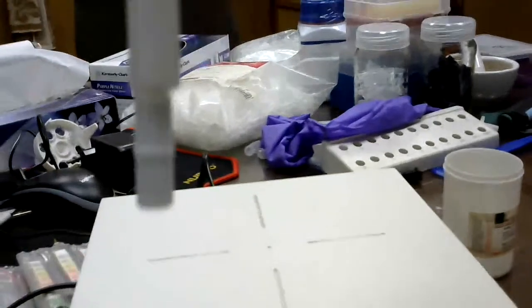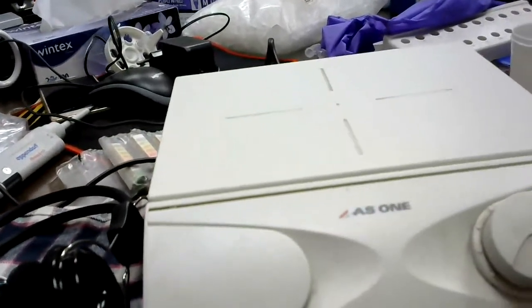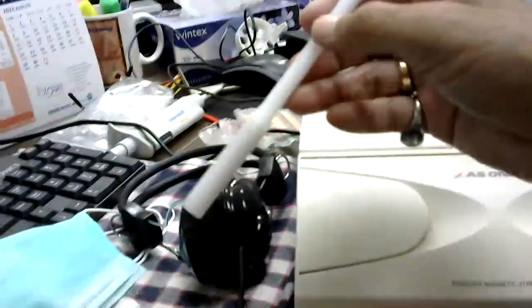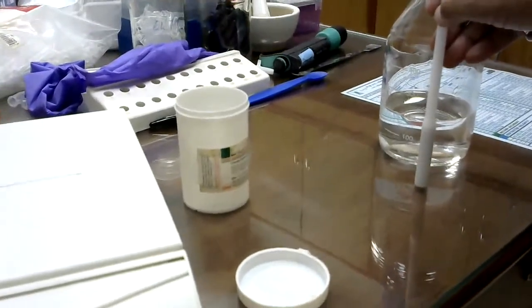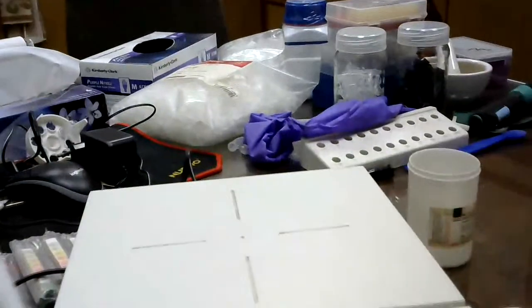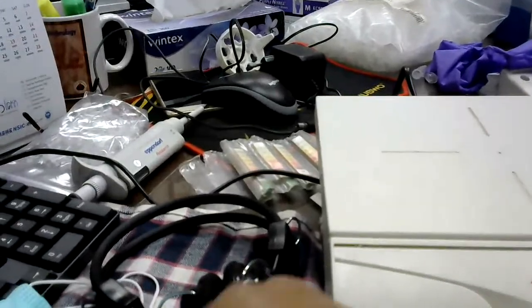You can see it sticking, because of the magnet, this magnetic bit has come out of that bottle, and then you can take it out like this. Okay, so this is something like a policeman taking that magnetic bar from the solution, and then you can wash it, and then you can use it.